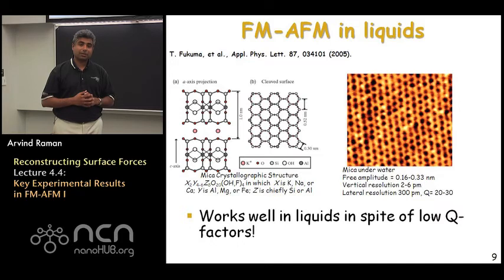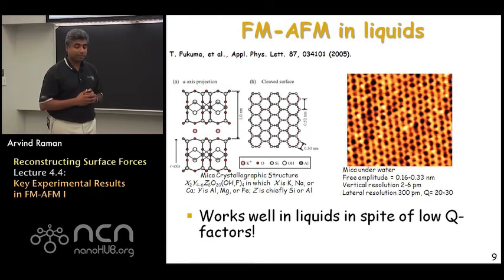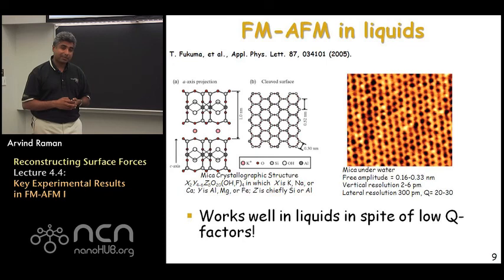So, the big question that arose with this finding that came out of Fukuma's and Professor Yamada's group in Japan was that you could operate in low Q environments and using FM-AFM actually get true atomic resolution, in this case of mica, in liquid environments.